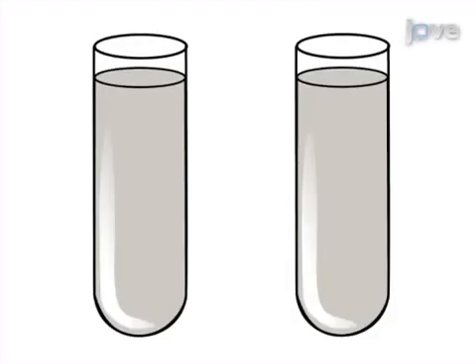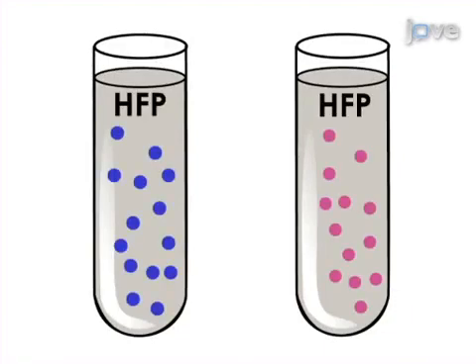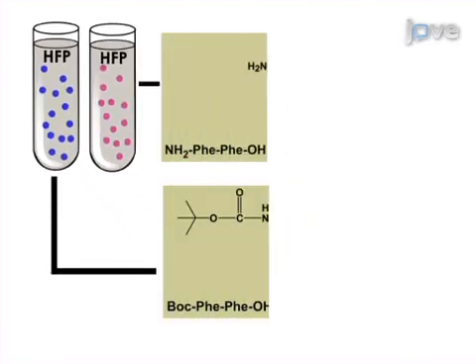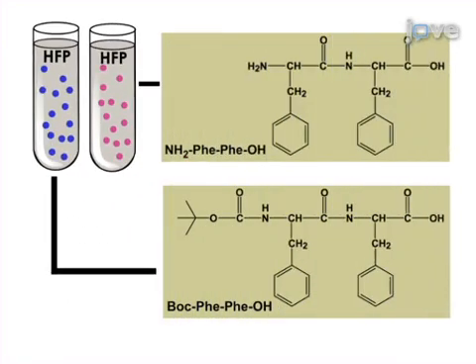This is accomplished by first preparing stock solutions by dissolving the diphenylalanine and its Boc-protected analog separately in the appropriate amount of HFP to a final concentration of 100 milligrams per milliliter.